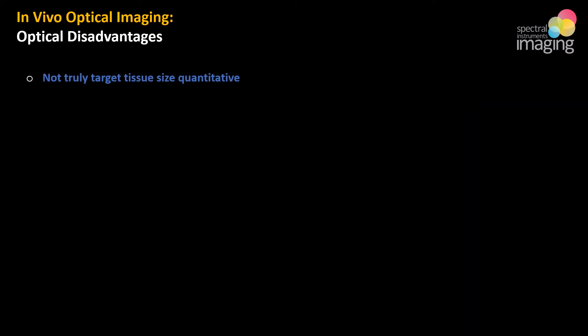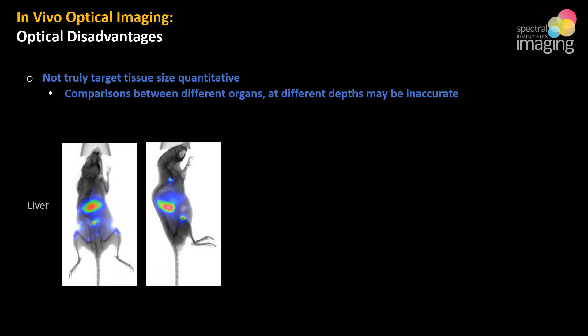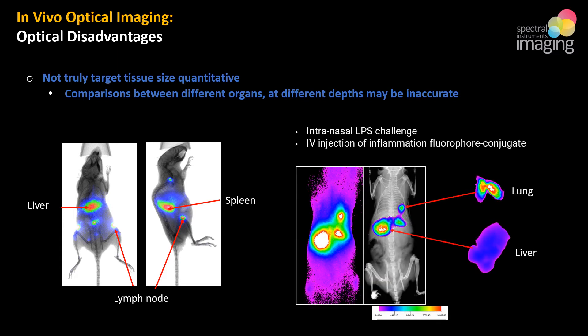Another disadvantage: the overlays shown are not quantitative of organ size as displayed, or between different organs, due to scatter, reflection, and absorption of light as well as the location of the organs. On the left, we can see optical light and a 2D X-ray overlay for liver and spleen, which look quite similar in size based on light expression, even though in a mouse we know these organs are not. In another example with induced lung inflammation and a targeted reporter, in vivo analysis appears to show greater inflammation in the liver, but ex vivo analysis shows the lungs with greater signal. Comparisons of tissues at different depths may not be accurate with optical imaging.